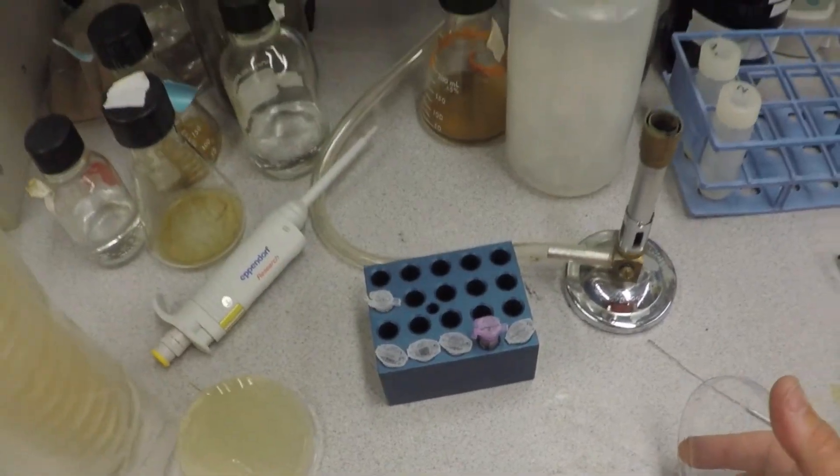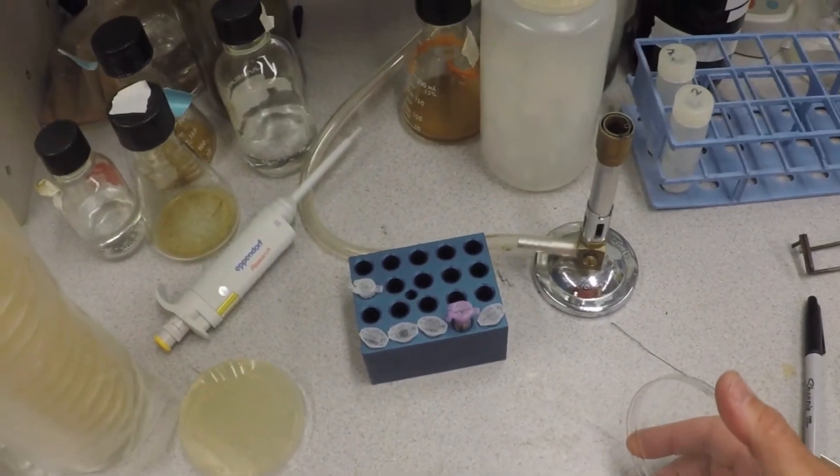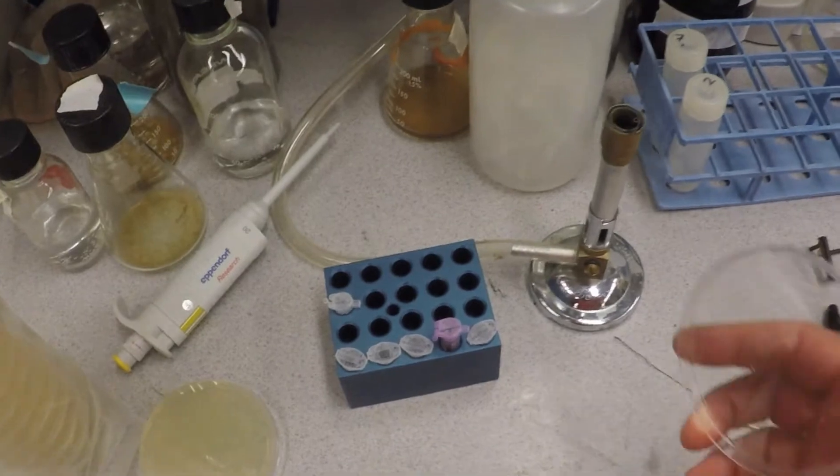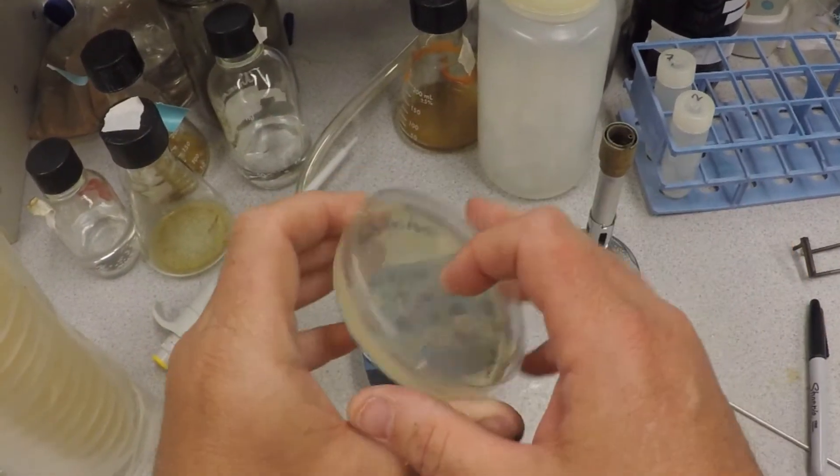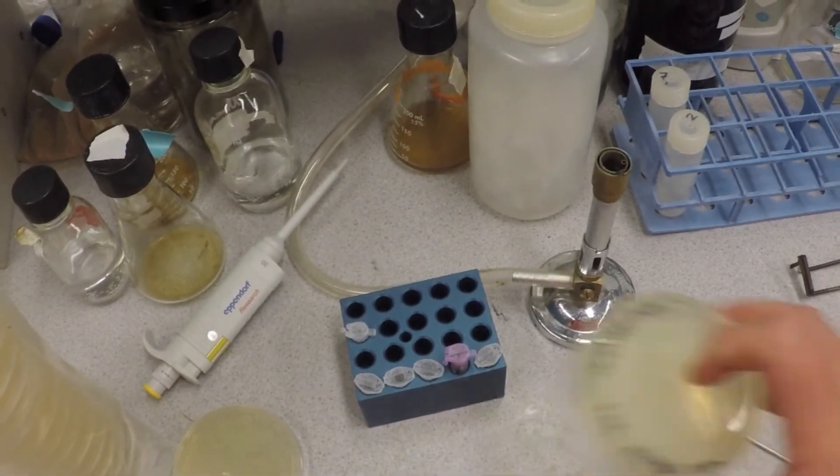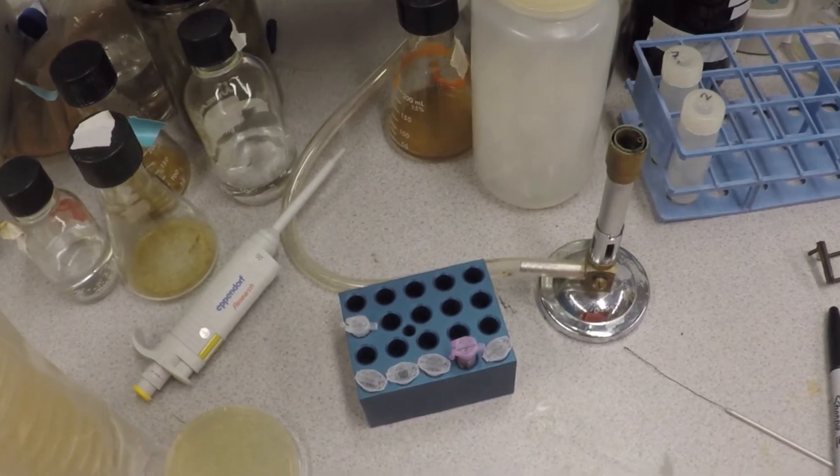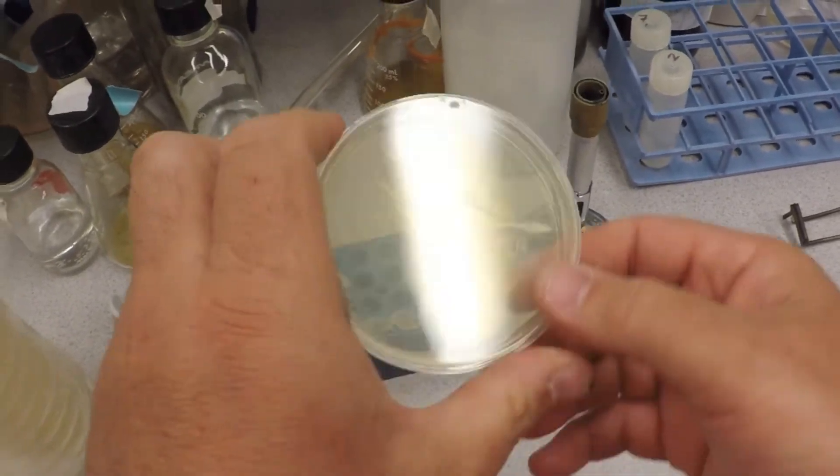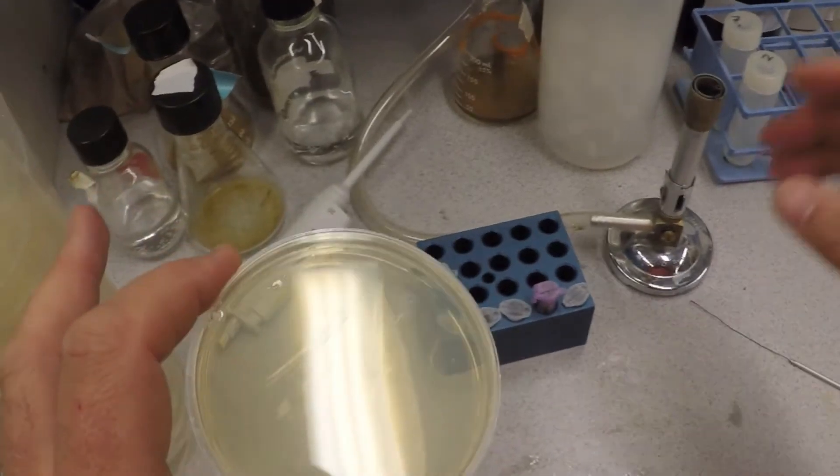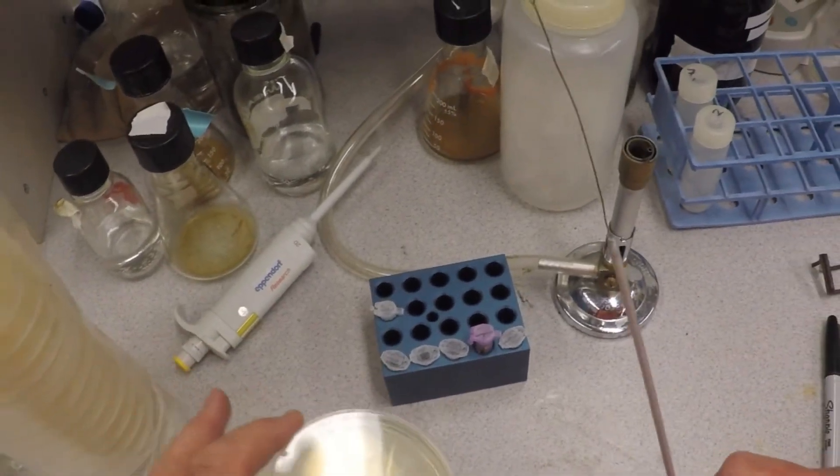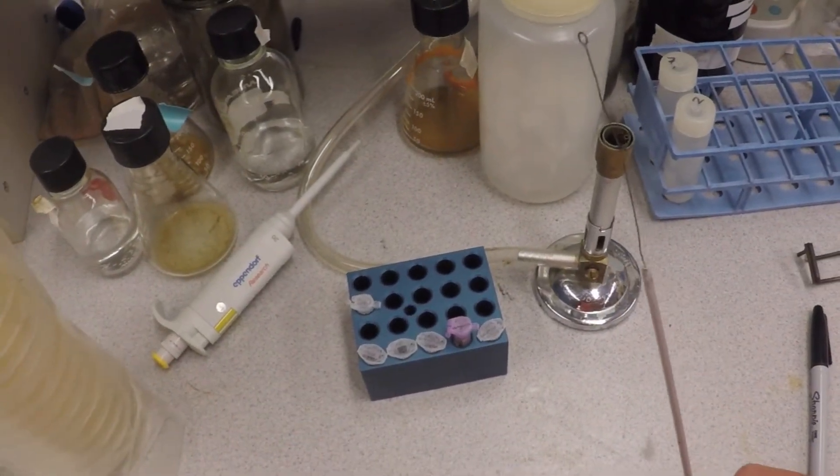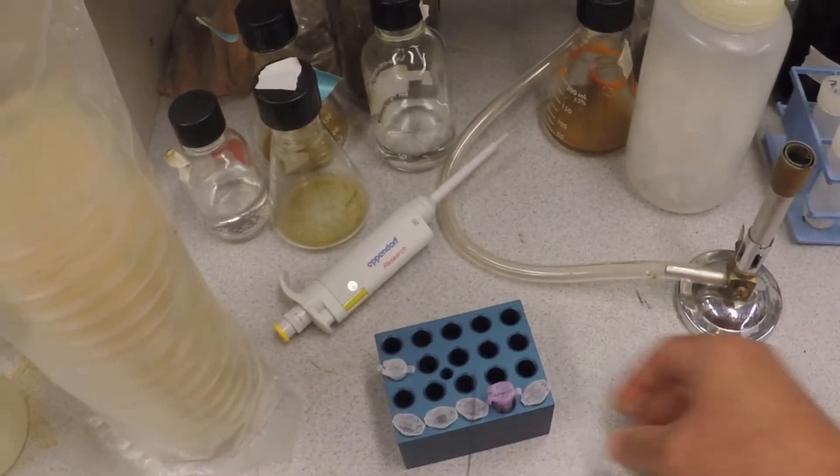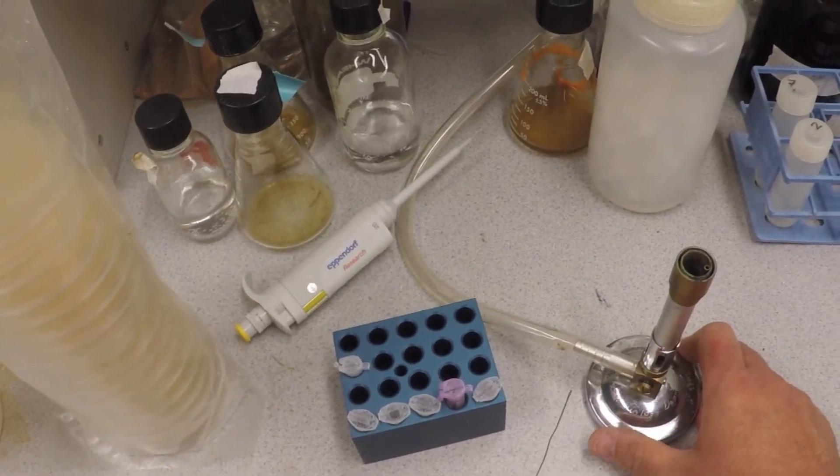We'll incubate those. That'll be a fun experiment. Now getting back to the task at hand, we're going to show you how to streak a plate. You need a way to sterilize that loop, and in order to do that you're going to use methane, you're going to use a flame, you're going to use gas.